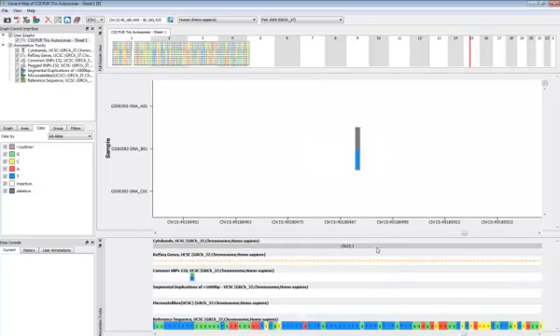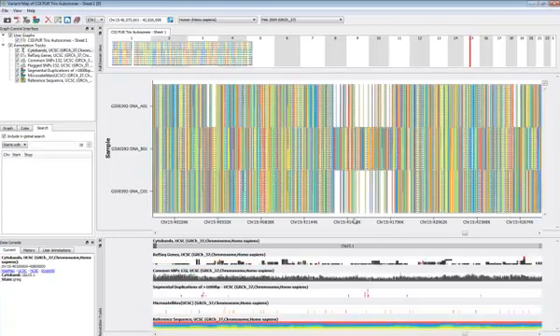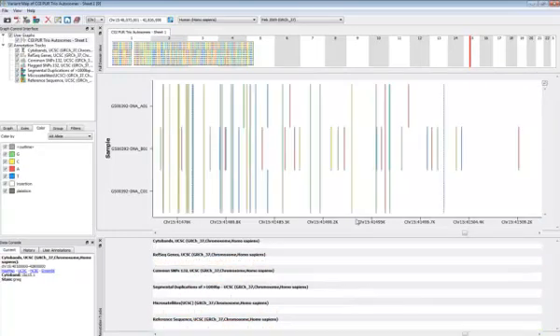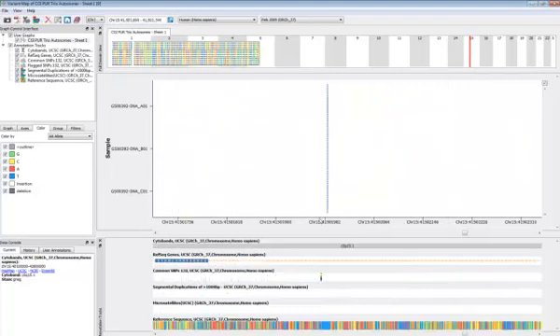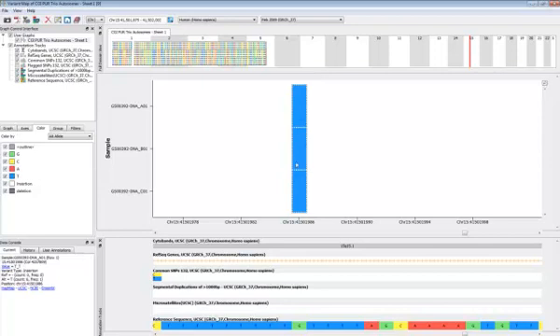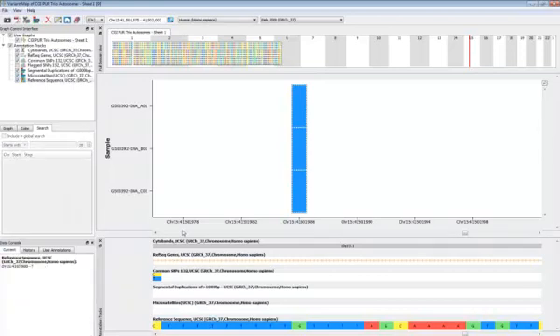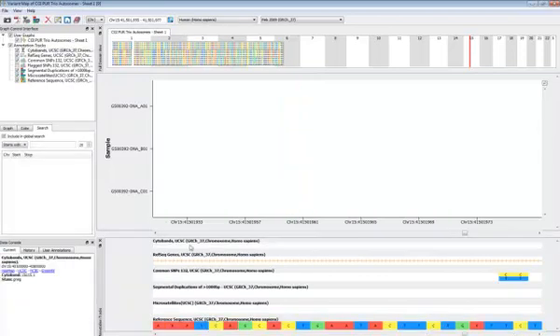If I zoom out further again, we can also see different types of variants. For example, at this position, this is a single base insertion that is carried by all three of our subjects. Notice over here at the bottom left in the data console that any time I click on a feature in the genome browser, I get additional information about that feature.